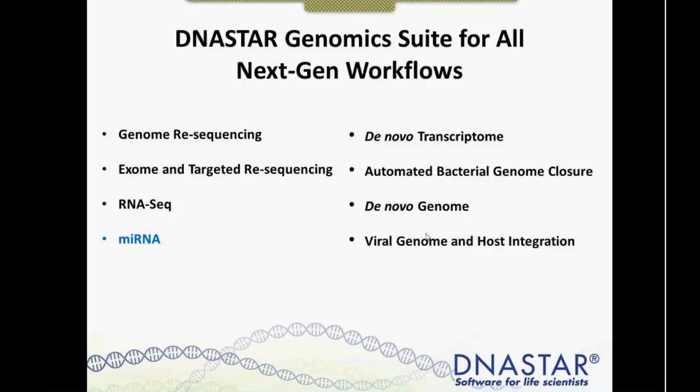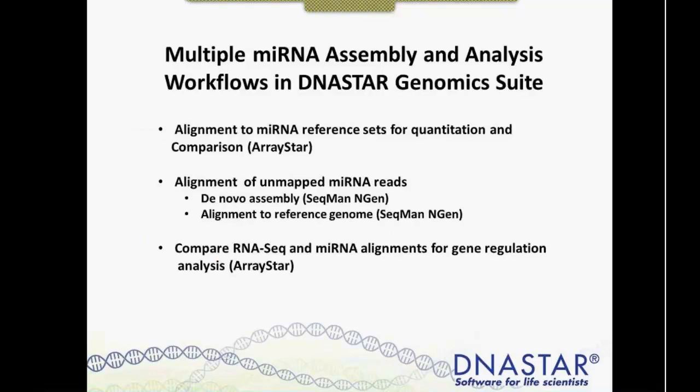So today, of course, we're going to focus on microRNA. And there are multiple sub-workflows with microRNA, and this is where, because some of you have different needs, some of these different sub-workflows will pertain to you more than others. So I'm going to try to just discuss the different options that you have in the software, and there are probably some other sub-workflows here that I haven't imagined or worked with customers on. And that's where you may have some questions. If you have a particular data set, we may have some other modifications to these workflows. So there are 3 kinds of workflows that I'll be looking at today.